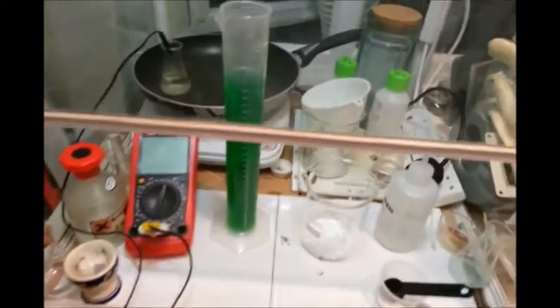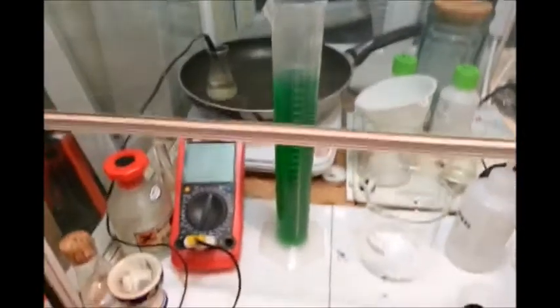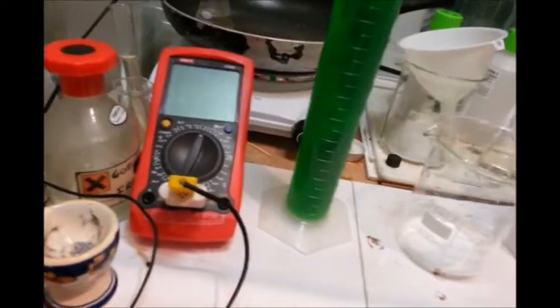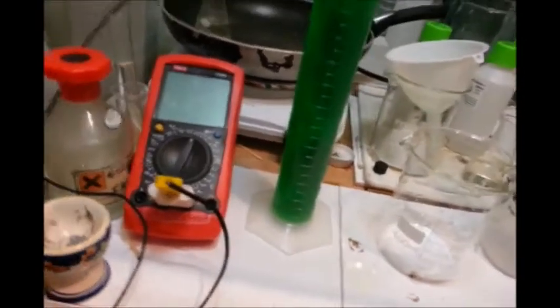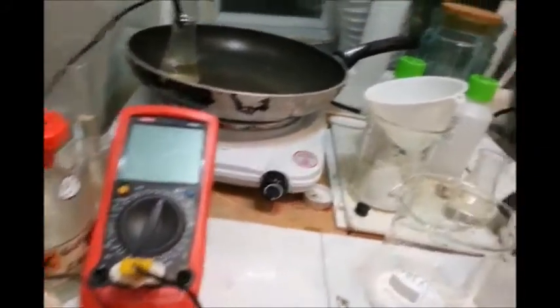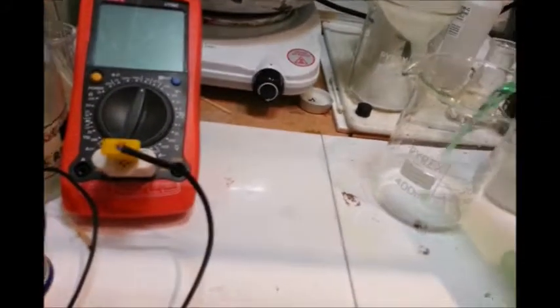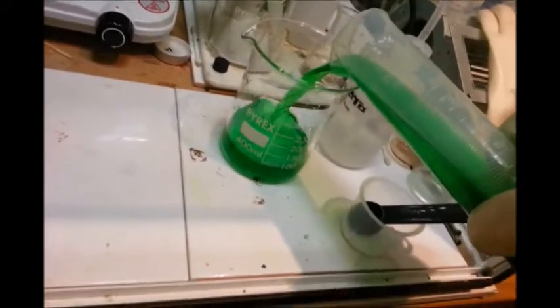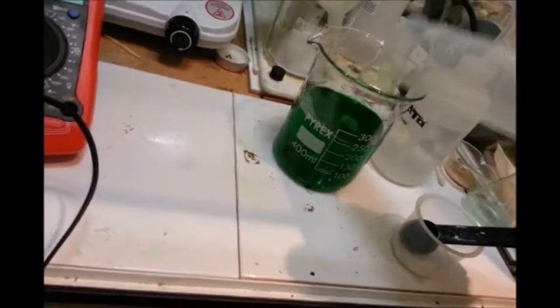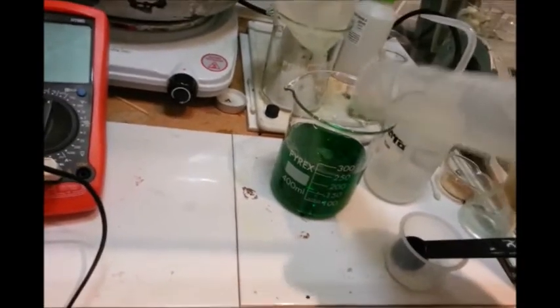Right, now all the solution has been filtered into the measuring cylinder. I'm going to pour it back into the original container, and then we're ready for precipitation. I'm just going to pour it in there. Much clearer now — it's been diluted, which is good. You can actually see what I'm doing.